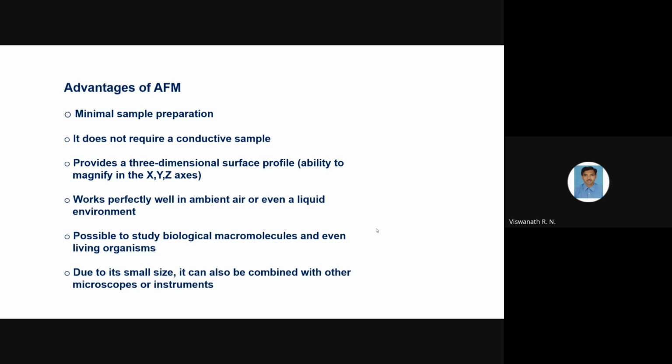The advantage is minimum sample preparation. It does not require a conducting sample like the scanning electron microscope. It provides a three-dimensional surface profile. It works perfectly well in ambient air, because the environment is not important. The only thing is we have to provide ambient air that is vibration free.